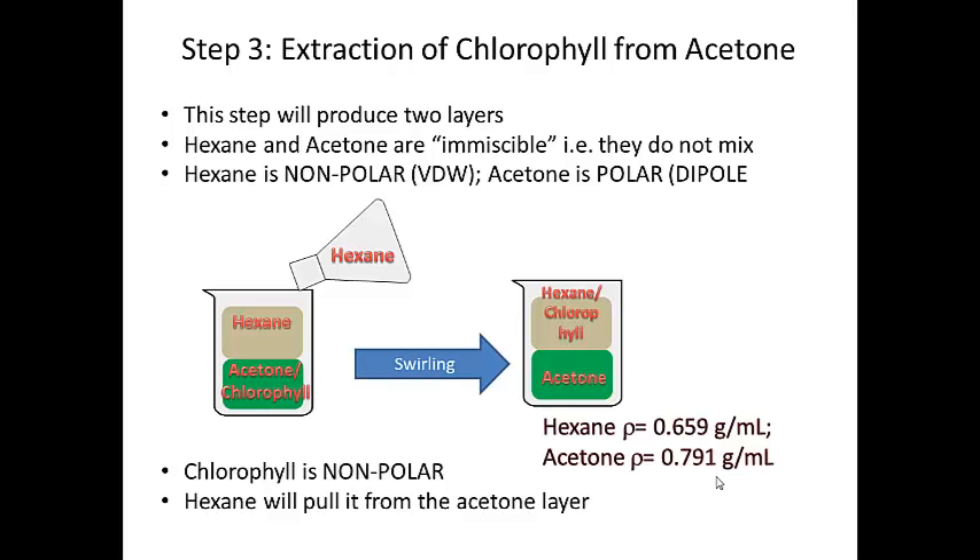Immiscible means they don't mix. If you've been paying attention in lecture, acetone is polar, hexane is nonpolar — both are organic — and so they don't mix. But chlorophyll, which is in the acetone layer, will actually mix with hexane. So you add the hexane layer, you swirl, and then that top layer is also going to contain your chlorophyll, pulled from the acetone layer. This is called an extraction.